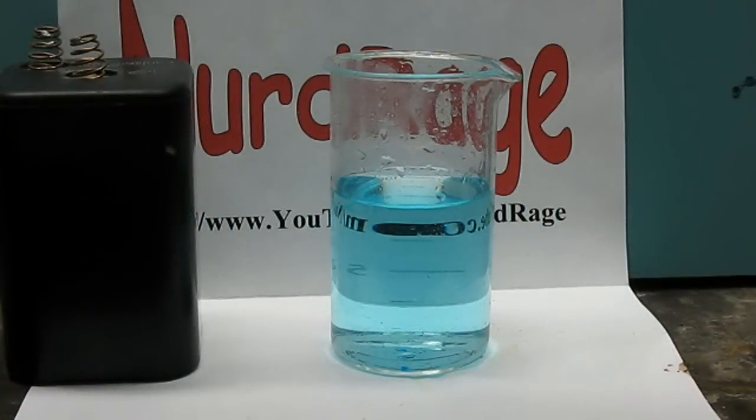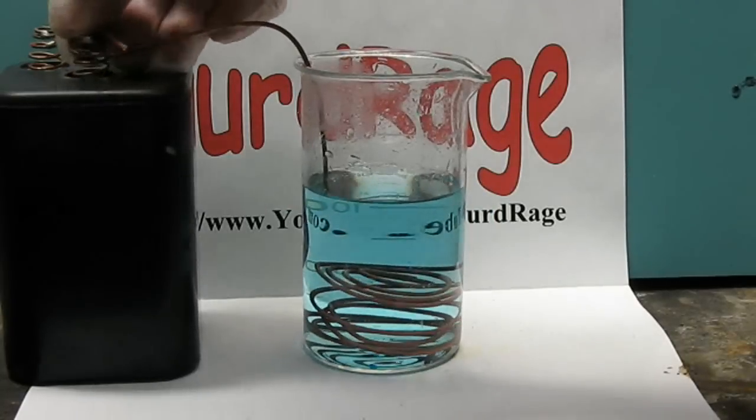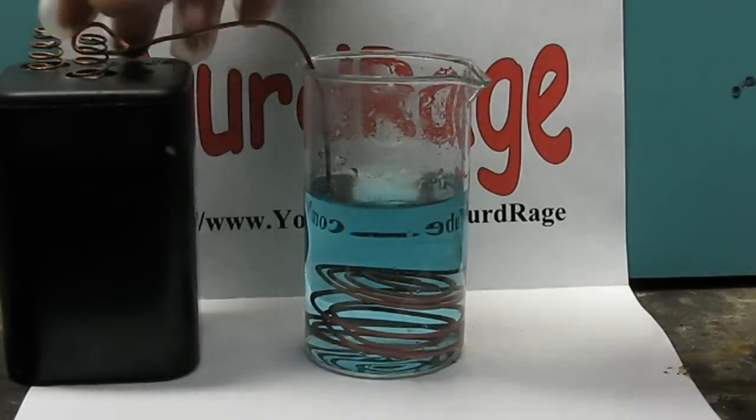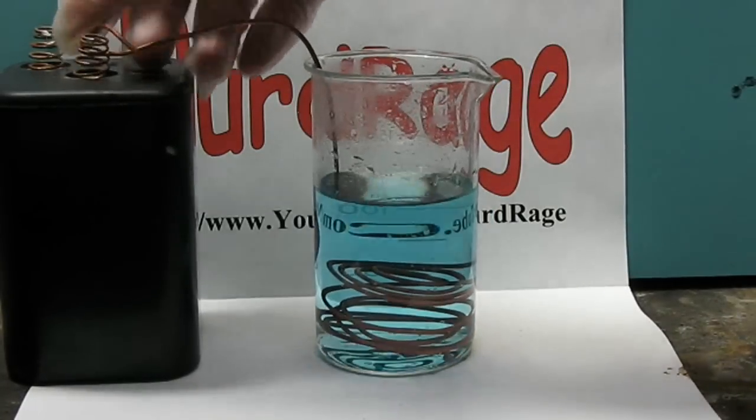Now make a solution of copper sulfate. The stronger the better. And place in the bottom a copper electrode. Attach the copper electrode to the negative terminal of your battery or power supply.